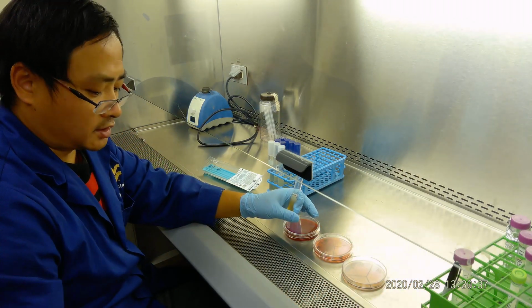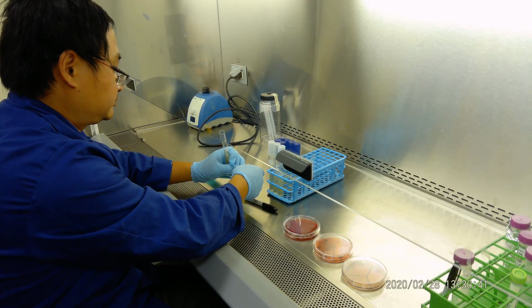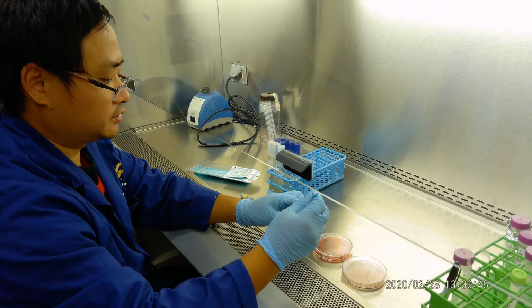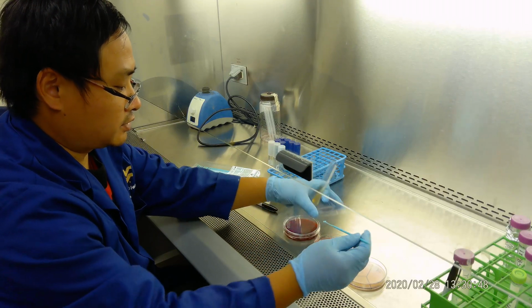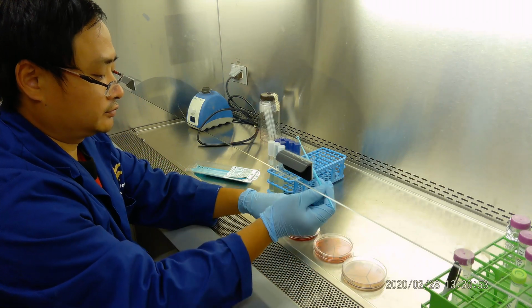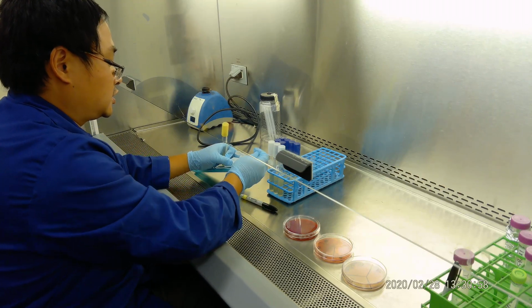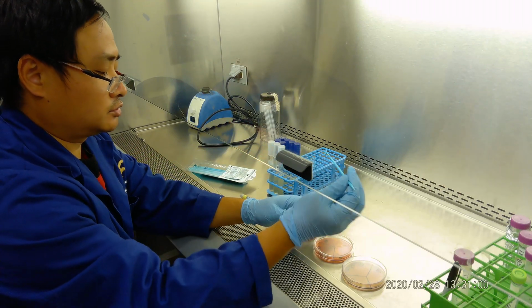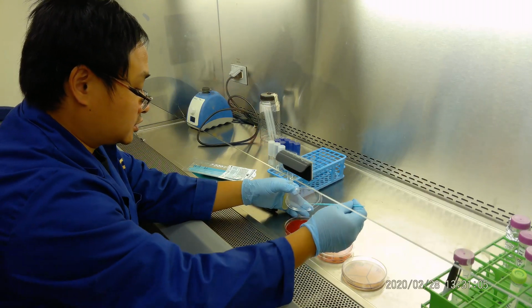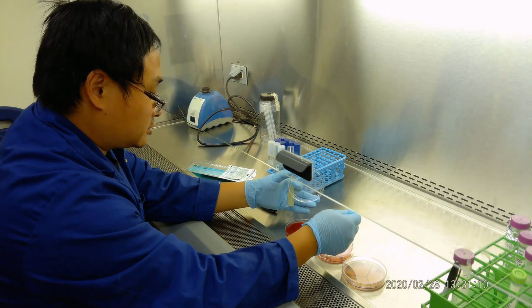Okay. Then we have to throw them away. Use the second one to do a very simple streak right here like that. You take a picture, and then for you it is just like doing a flame. So that will be that. Okay. So we'll be doing this. So Staphylococcus aureus. You have to label this carefully. It will be on this corner. So like that.